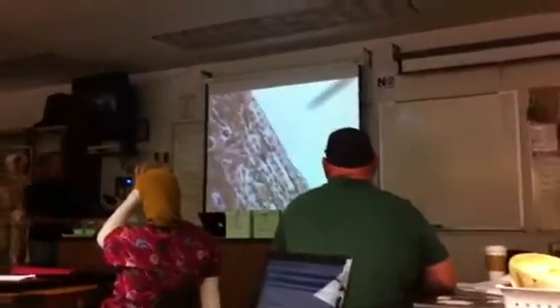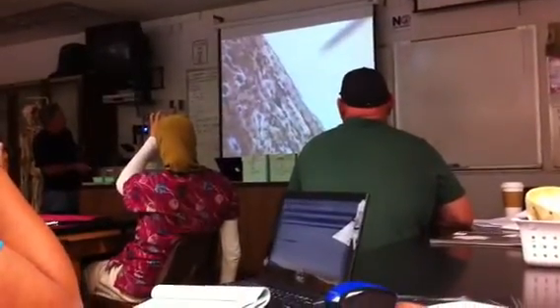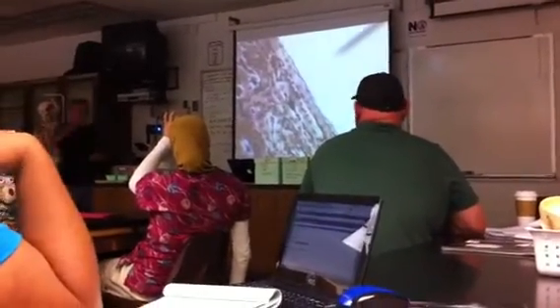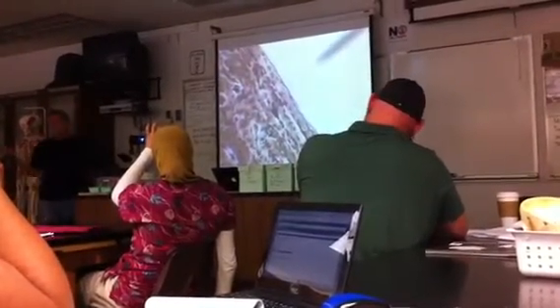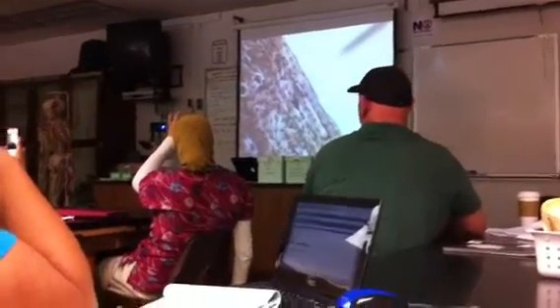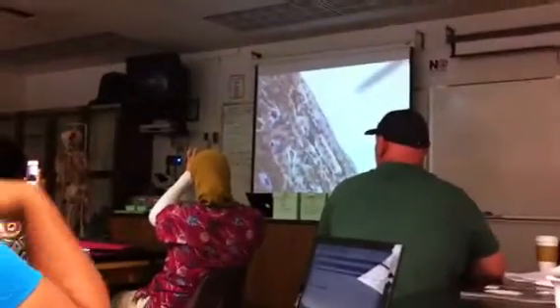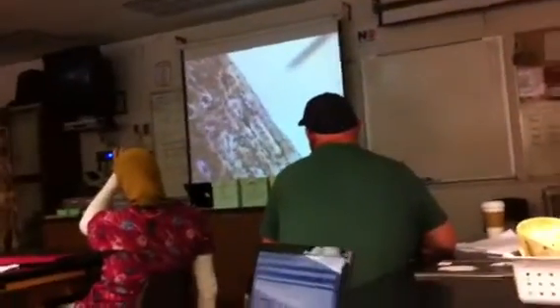Let me just move the slide and we'll see if we can. Oh, you kind of sort of see. Where's my pointer? You can see how the lamellae is laid down more in a circular pattern along the edge. So they call that circumferential lamellae. On that model, I know you know where it is. So this would be the circumferential lamellae, right? Bone along the edge.